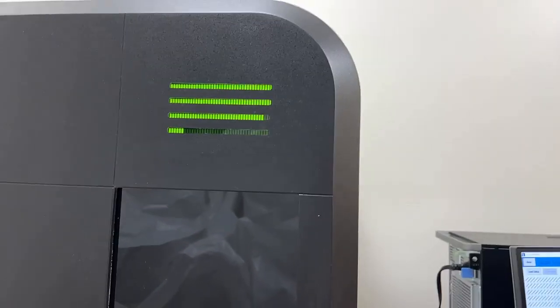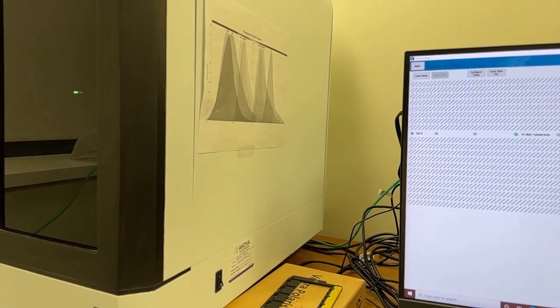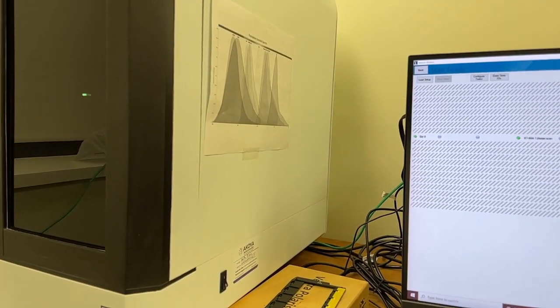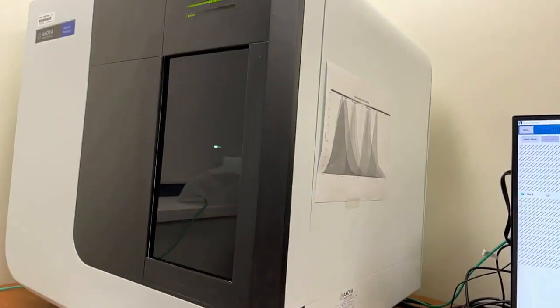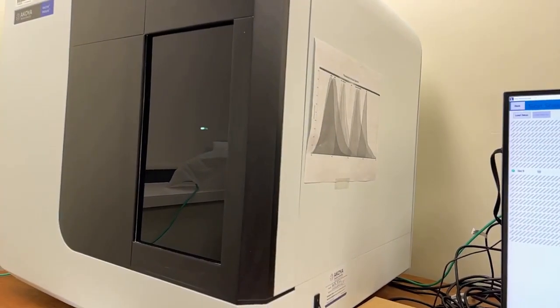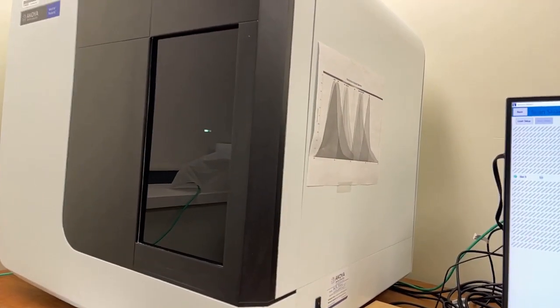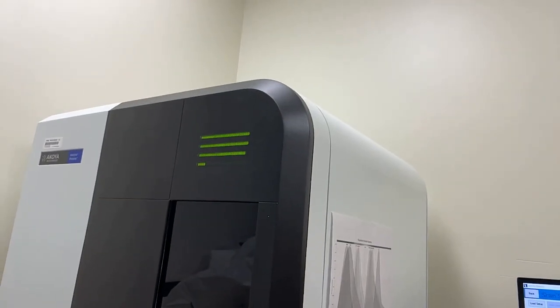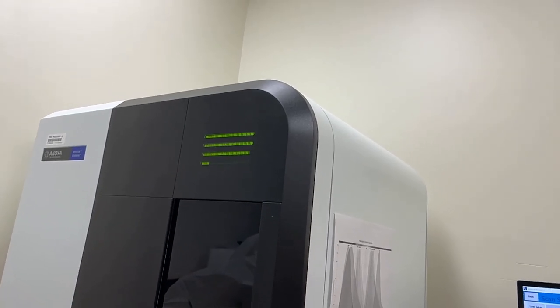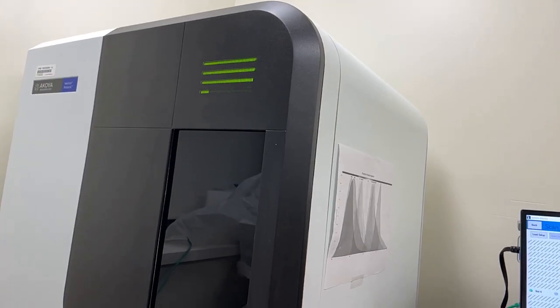The first two were done because they were blank. And the third one's got the slice in it. What you're supposed to do is put the single slide at the very end of the slide carrier, so then it just finds that there are no sections in the first three, and then it goes to the last one, and then you're done.